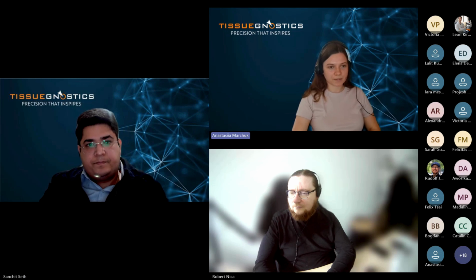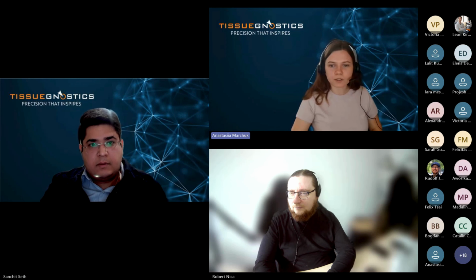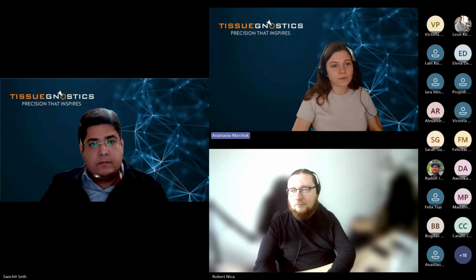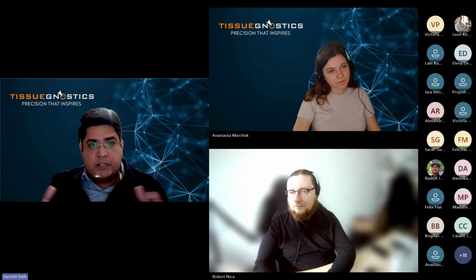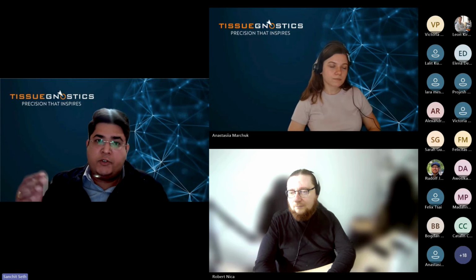Okay, I see. And we have the last question, I think, if there's nothing else from the audience. I understand TissueGnostics is based in Europe. How do you provide support to your users on other continents? Although our headquarters is in Europe, in Vienna, Austria, we have a global structure. We have TissueGnostics USA on the East and West Coast, TissueGnostics China, and TissueGnostics South America.